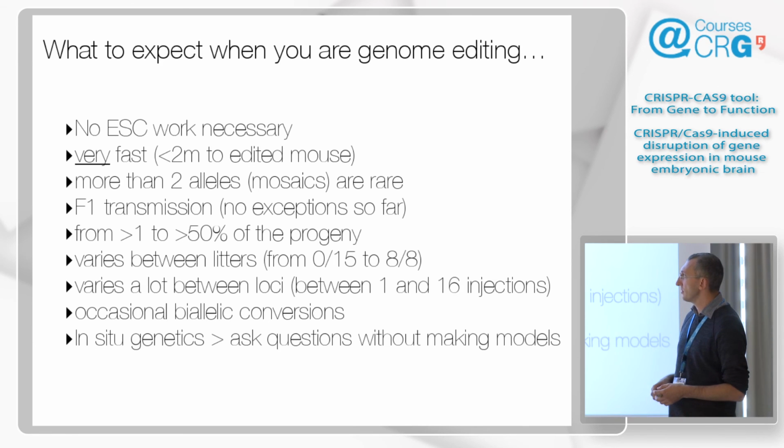It takes less than two months. Basically, it's the time for development, plus a day for injection, and some time to prepare the reagents. Almost everything transmits.